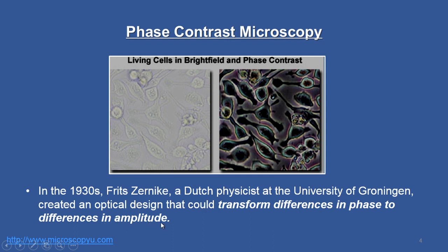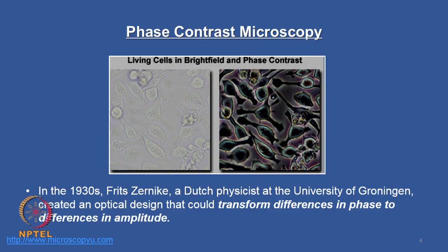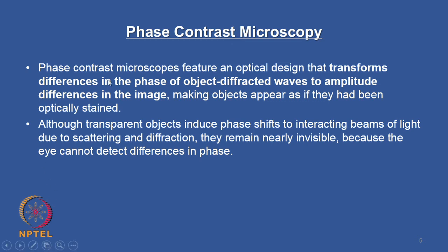I just mentioned that there will be a small change in the phase of the object. So, the differences in the phase in the object are transformed to differences in the amplitude in the image, which will enhance the contrast. So, we will now see that. Let us go through the introductory remarks.